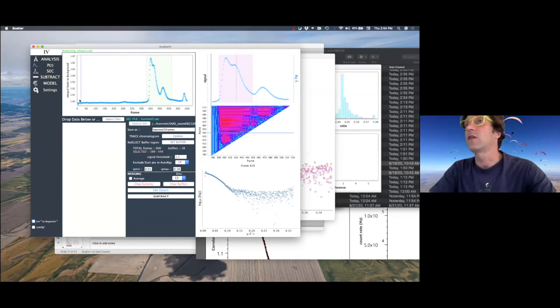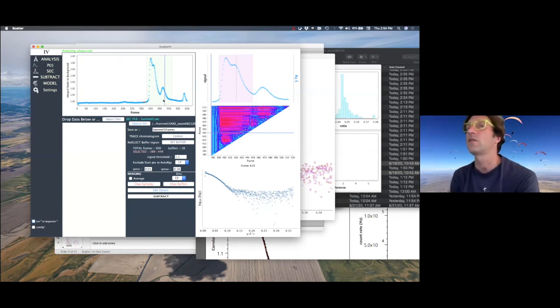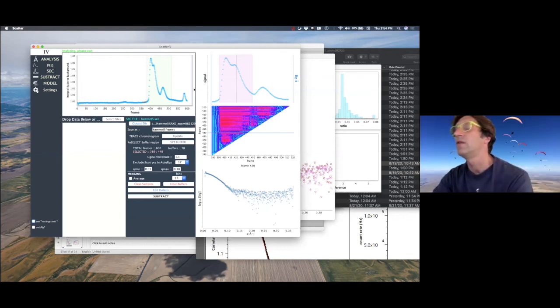As you can see in this case, our baseline became much more flat and everything seems nicer. But there have been cases last year especially that you had a hard time to really subtract your peak because of fluctuation up and down as the AC was on and off.